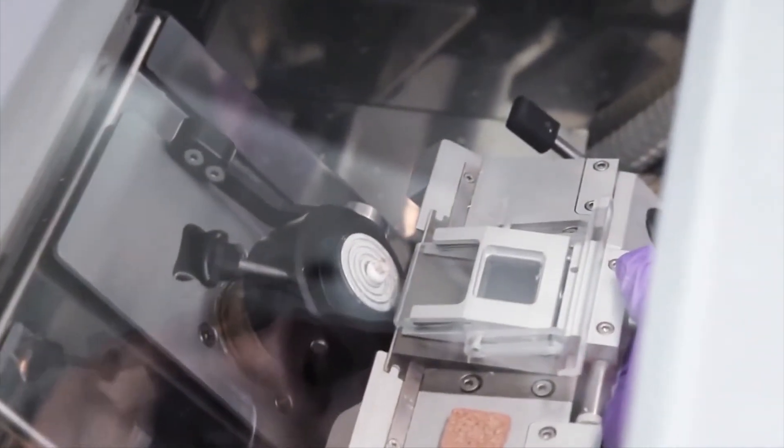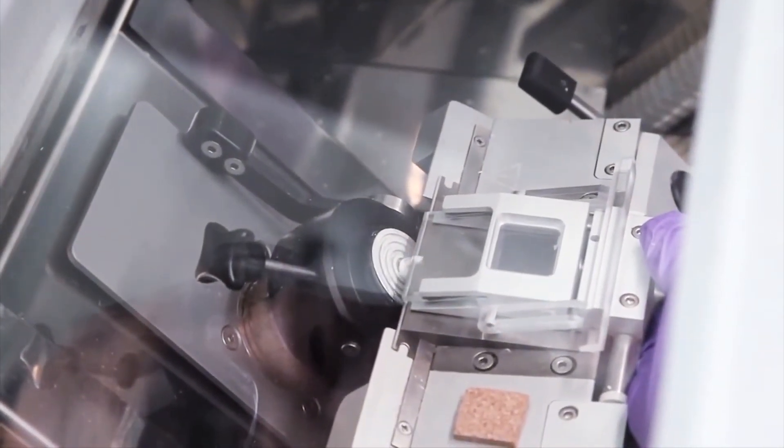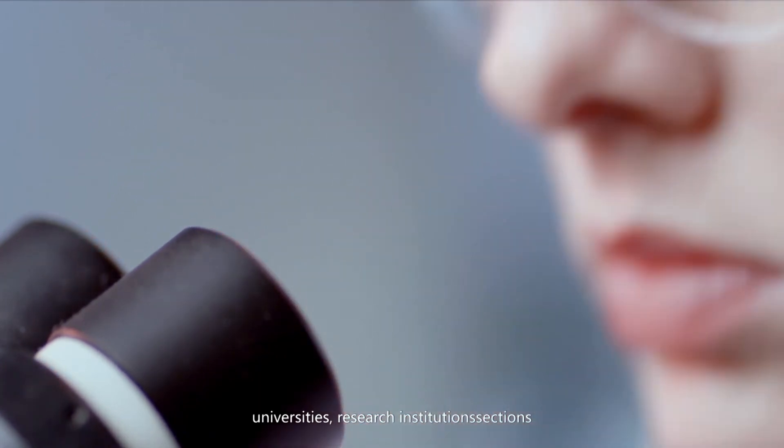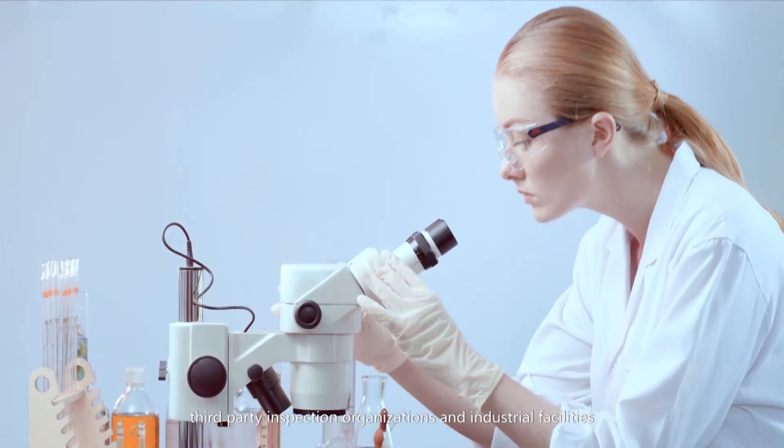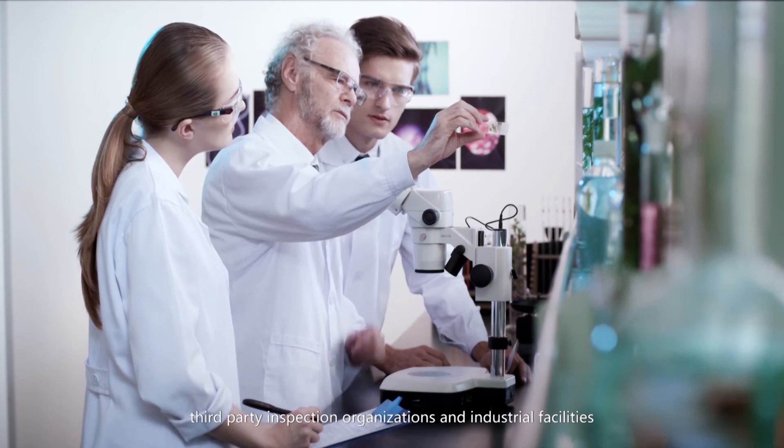In many pathological laboratories worldwide, to include hospitals, universities, research institutions, third-party inspection organizations, and industrial facilities.